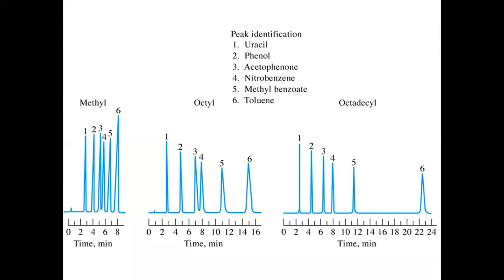in liquid chromatography and in gas chromatography, the type of the stationary phase may be changed in order to increase the resolution. So you can change the octylsilane to octadecylsilane. Before octylsilane, you used methylsilane, so you failed to obtain the required resolution. Therefore, you moved to octadecylsilane, and you achieved the required resolution. Therefore, the separation has become efficient for these six compounds.